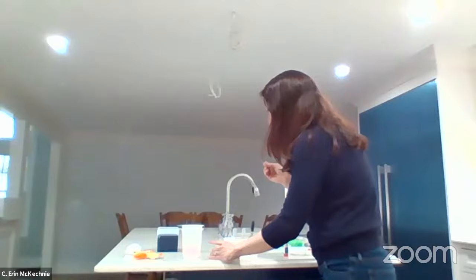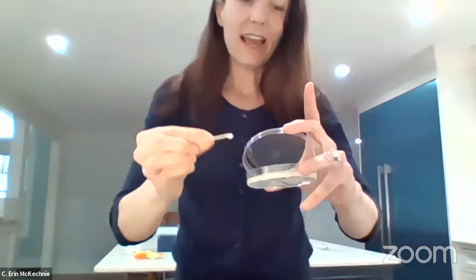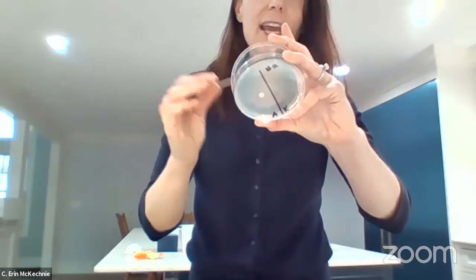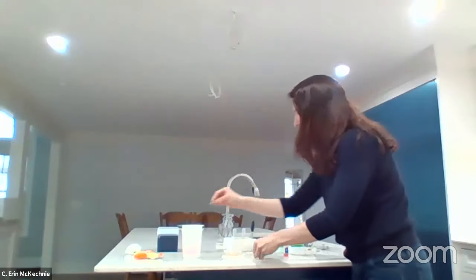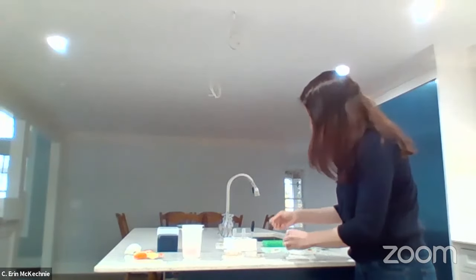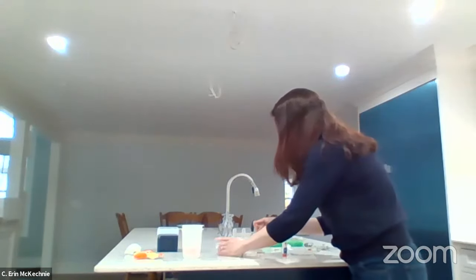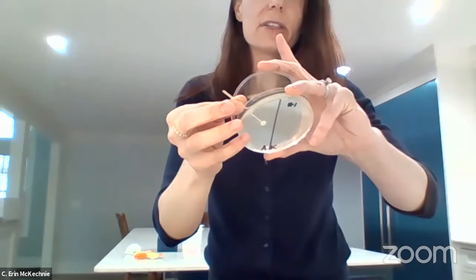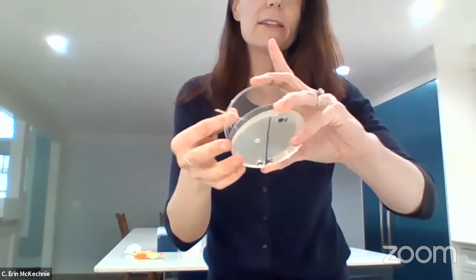Okay. So I take either of my dishes and I'm just going to open it a little bit. I don't know if you can see me doing this. I am just gently tapping that little pill, that antibiotic, right onto the top of that gel. And look, it sticks. It's kind of stuck on there, which is perfect. I'm going to get a new toothpick. Just use the glue a little bit. Remember to make it a little sticky. And this is my other plate, so I'm just going to put it on the A side, just like I did on that previous plate.